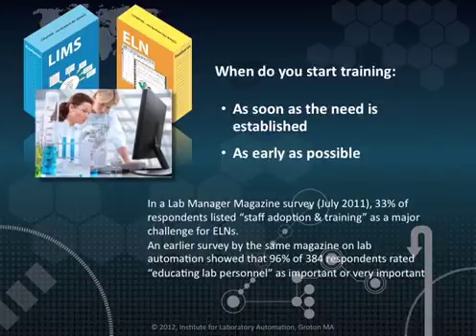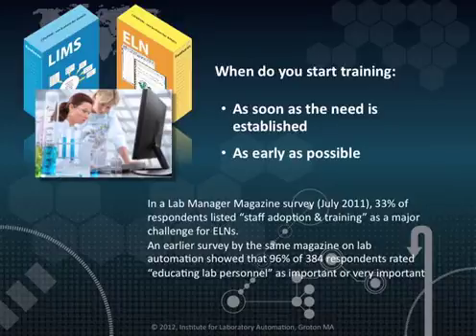Start people's training as soon as the need is established and the number of candidate products has been narrowed down. It should be done as early as possible. In a July 2011 survey by Lab Manager magazine, a third of the responses listed staff issues as a major challenge for electronic laboratory notebook implementation. An earlier survey showed that educating laboratory personnel is a high priority.